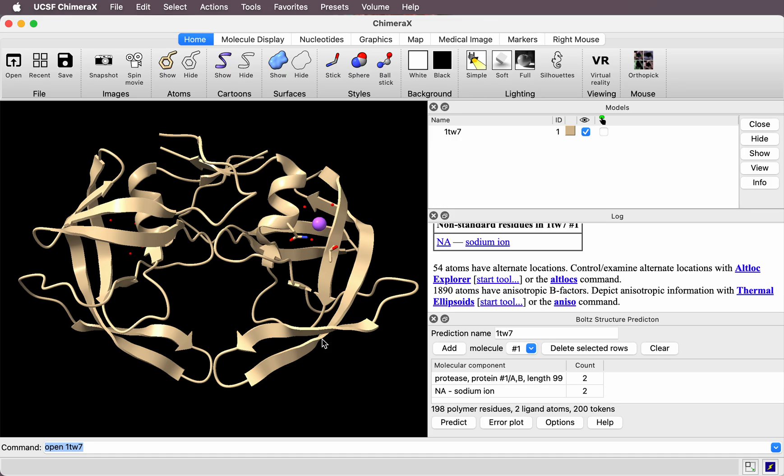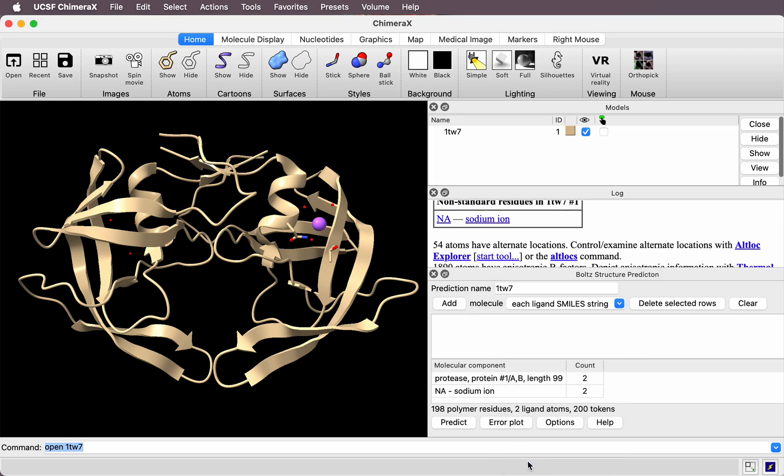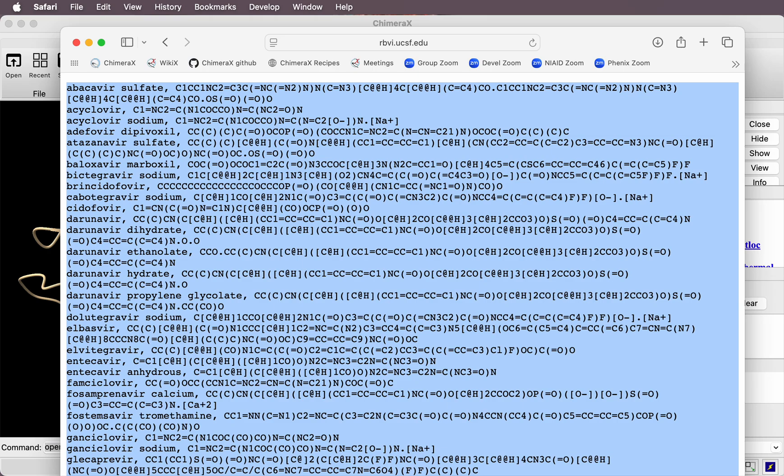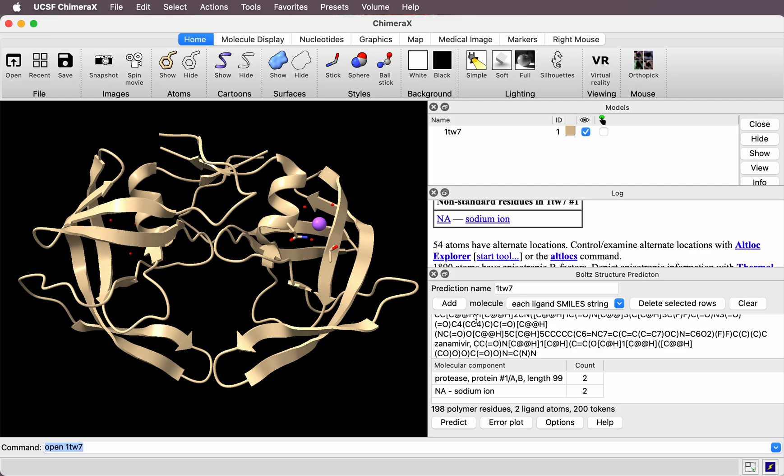Now I want to add the 52 drugs that we want to dock. To do that, under this menu, I choose each ligand SMILES string. I've prepared a file of the drug names and a comma, then the SMILES string representing that drug—one drug per line. I'm going to copy and paste that here and press add.